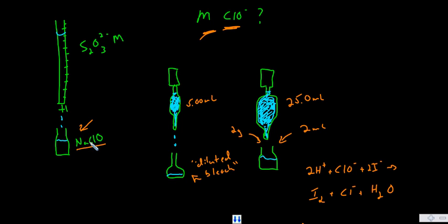Generally, if you want to do some kind of analytical test like that, at least in general chemistry, you'll probably be using titration. So you might consider, perhaps we can add some acid to this base, hypochlorite, to form hypochlorous acid, and we can determine via acid-base titration.